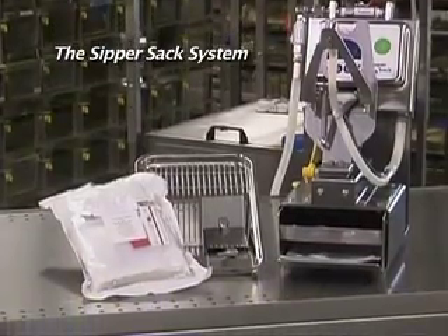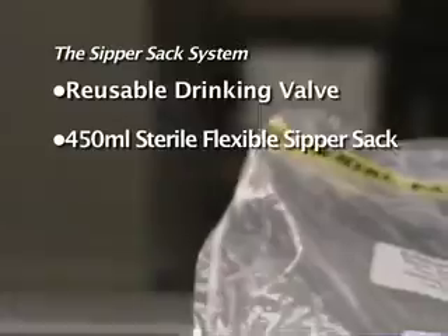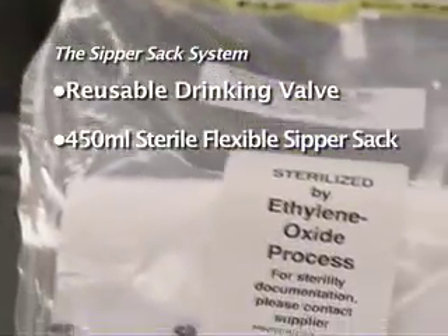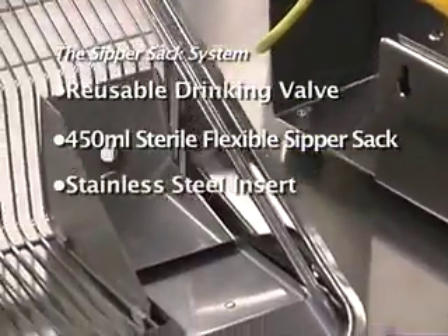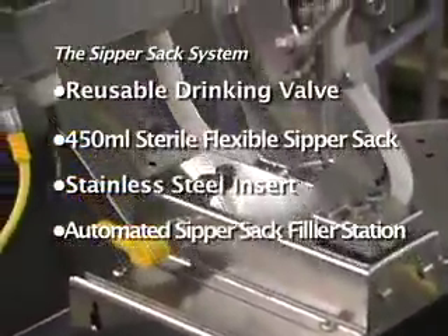The Sippersack system consists of a reusable autoclavable drinking valve, a 450 mL sterile Sippersack, a stainless steel insert for your existing wire bar lid, and the automated Sippersack filling station.